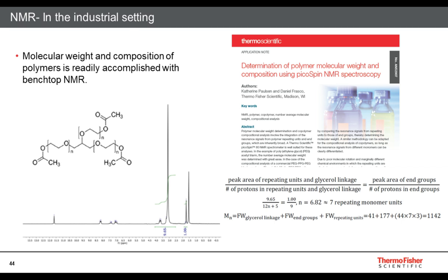We can look at these ratios and combine that with the other information we know about the starting material and determine things like the molecular weight, the composition, the hydroxyl number, all of these things that determine a polymer's physical characteristics and are very important in their daily lives, but without all the fancy math that we sometimes see in interpretation of small molecules.